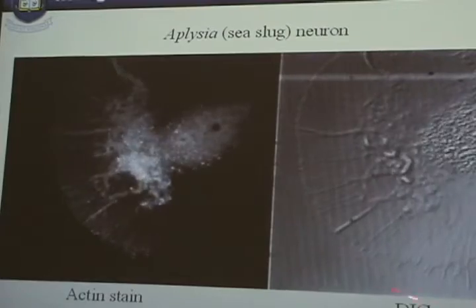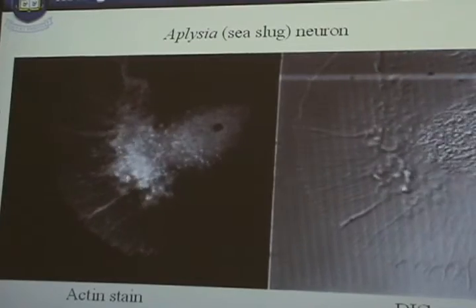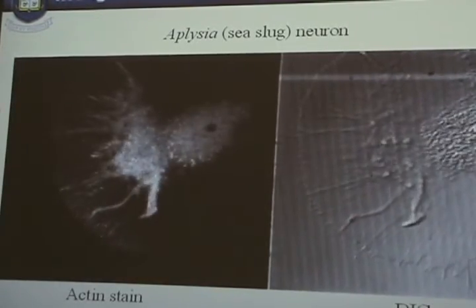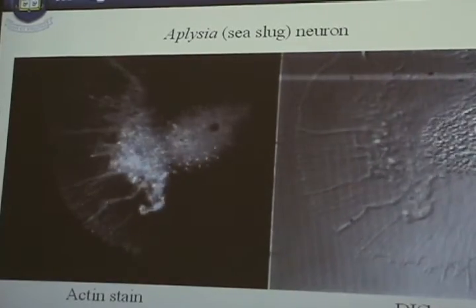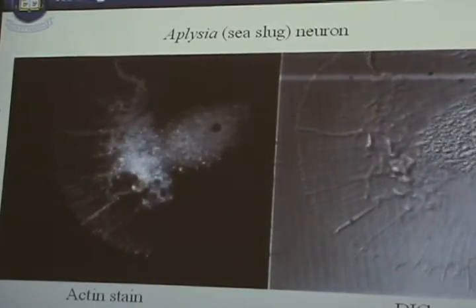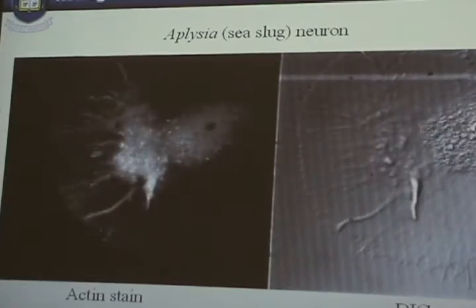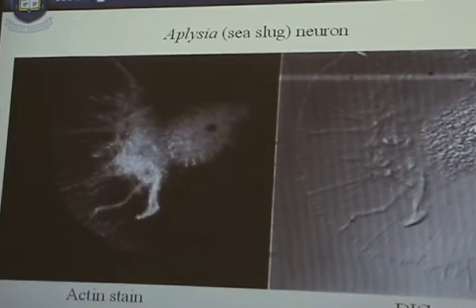This is the leading edge of the neuron, and you can see there's all sorts of interesting mechanics happening up here. With modern biochemistry, we can create versions of the relevant proteins that are fluorescent, or inject things that bind to the relevant proteins and fluoresce, to visualize the kinematics and the dynamics of what's happening inside of the cell as it crawls. In this movie, you can see where we've made the actin in the cell. The actin is a molecule I mentioned earlier. It works with myosin to contract our muscles. But actin and myosin also work together in a crawling cell to pull the cell forward.